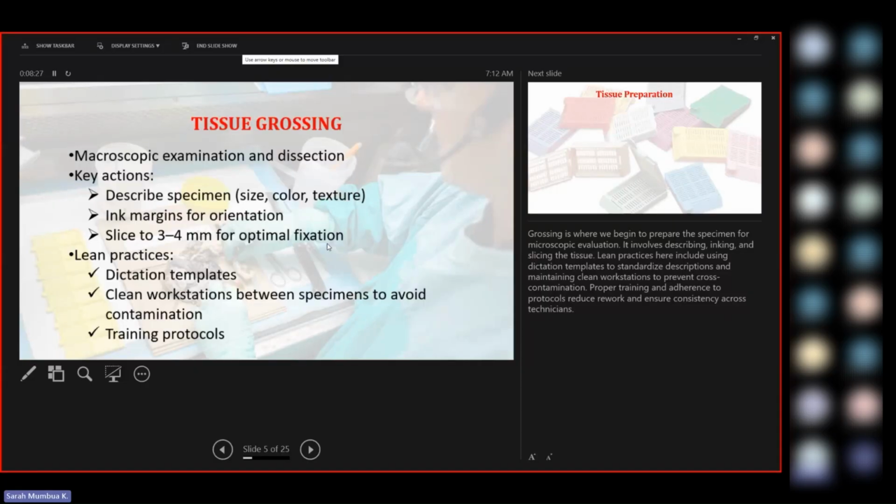In this step, some tissue is too big, like a mastectomy specimen. You do not expect it to be fixed normally just by immersing it in formalin for 8 hours. So here you can do bread loafing. You slice it just the way you slice a piece of bread into smaller pieces, then allow it a longer time to fix better. If you're dealing with an amputated leg or a bigger tissue, make sure to make it smaller so that the formalin can mix well.